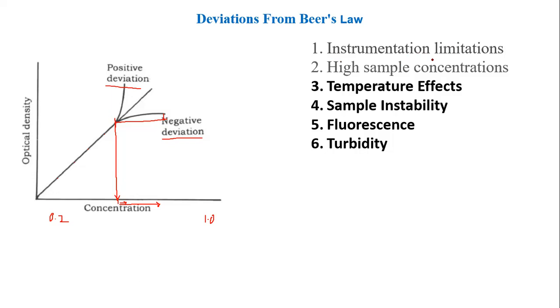Have you been in such situations? Okay. Yes, sir. How many of you actually do this, meaning you check the blank before checking the absorption of every sample? Yes, sir, you do that. Okay, very good.